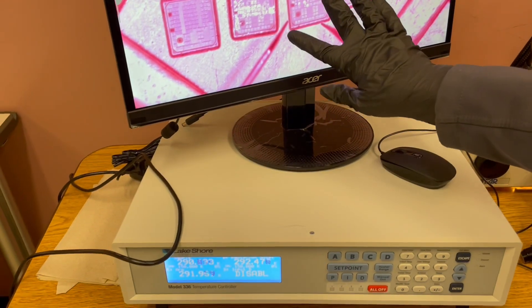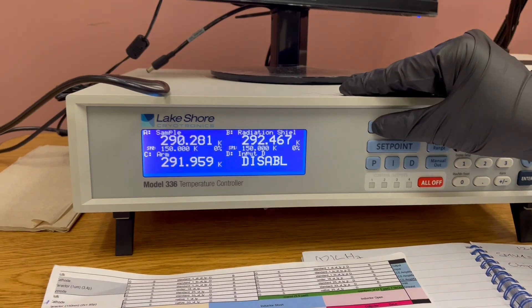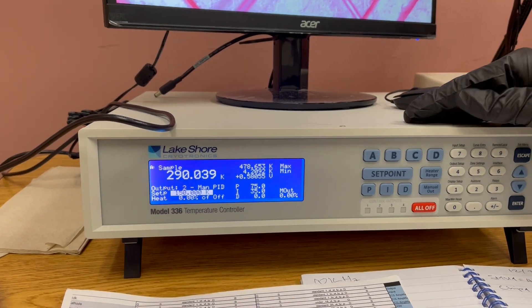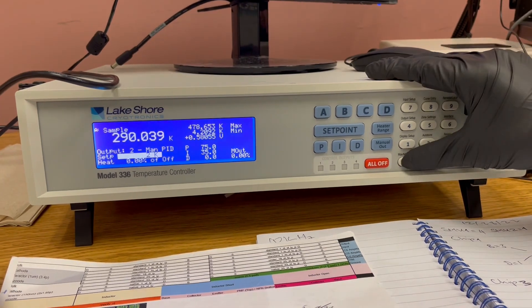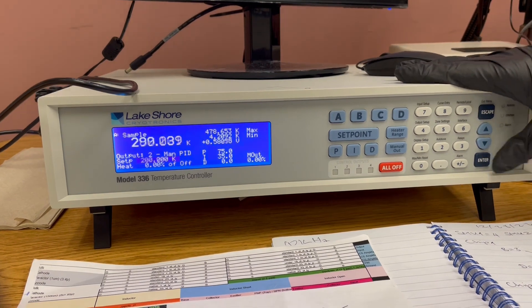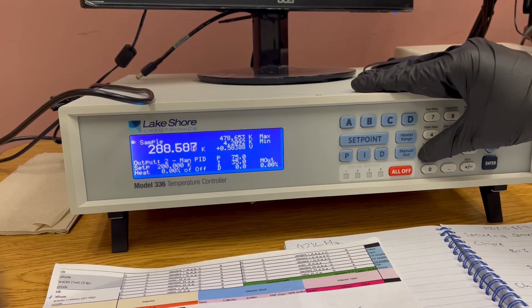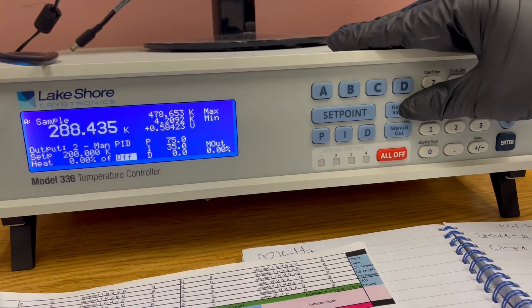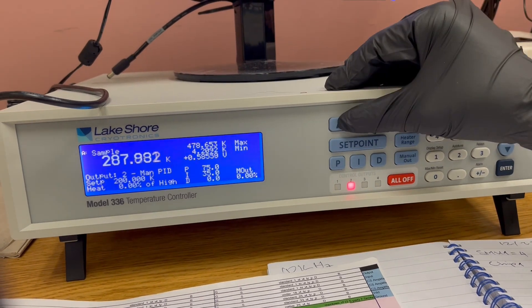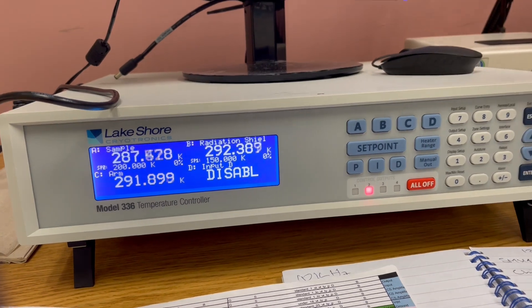Now, we know that this chip might pop if we cool it down too fast. So what I'm going to do is to set the set point for the sample stage. I will make it at maybe 200 Kelvin. So I'm going to turn on the heater. How do you turn on the heater? Go to A, and then turn on the heater ring, and then choose. I will do high for now. The goal is to make sure that it does not cool down too fast. Otherwise, the chip may pop.